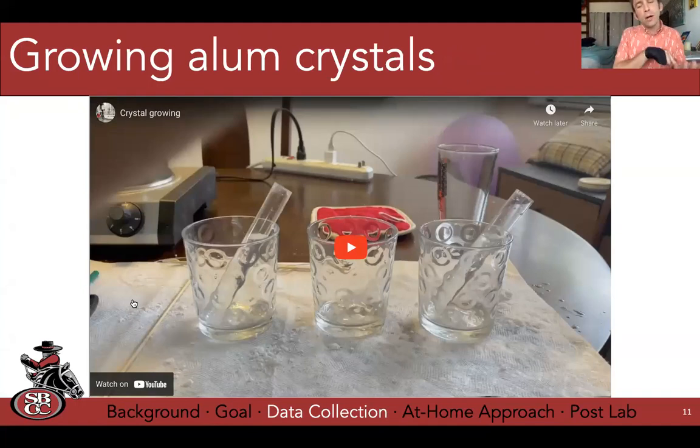So now we grew our seed crystals, so we have to make at least 1 more solution. So 2 saturated solutions, and now we have our seed crystals to dangle in the middle of our solutions. So I'm going to use test tubes here just because I have test tubes. I ended up using mason jars a lot. So you can see I have a few different ways of suspending the crystals in mason jars. Let's see what else. I just used cups. I used a big mason jar eventually. So lots of different things.